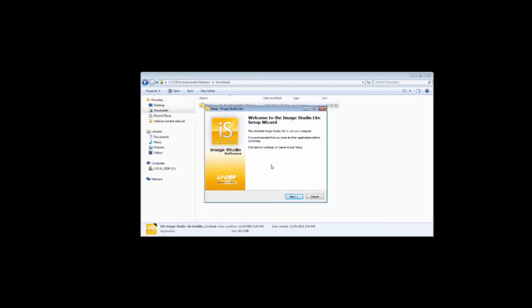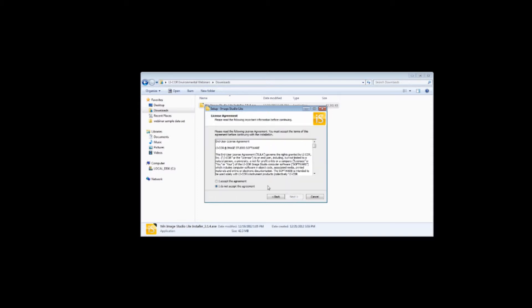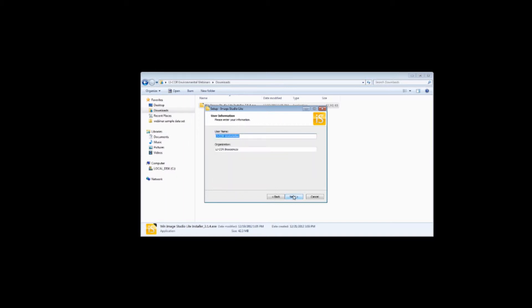Once the installer launches, an ImageStudio Lite software setup dialog box will appear. Follow the instructions in the installer, accepting the user agreement, then entering a user name.